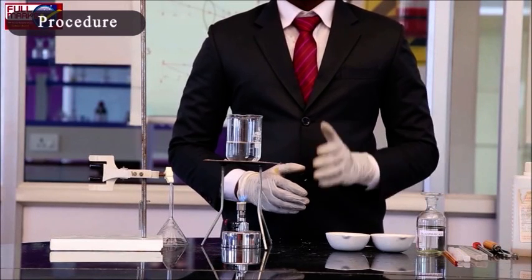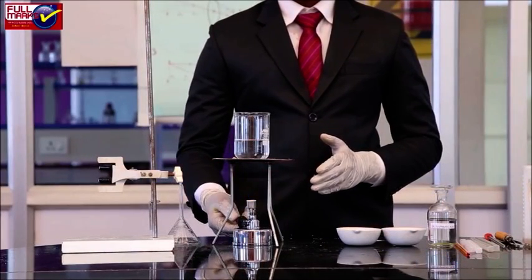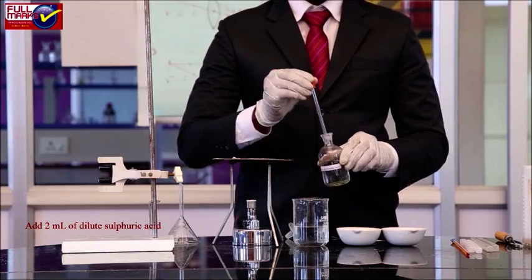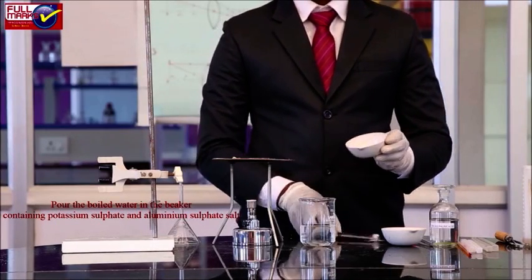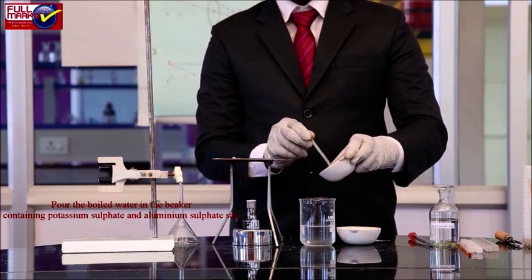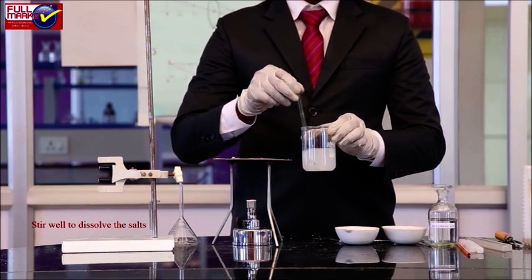Procedure — preparation of solution: Take 3.5 grams of potassium sulphate salt and 13.3 grams of aluminium sulphate salt. Boil 100 ml of distilled water in another beaker and add 2 ml of dilute sulphuric acid in it. Pour the boiled water into the beaker containing potassium sulphate and aluminium sulphate salt. Stir well to dissolve the salts, using the minimum amount of water.